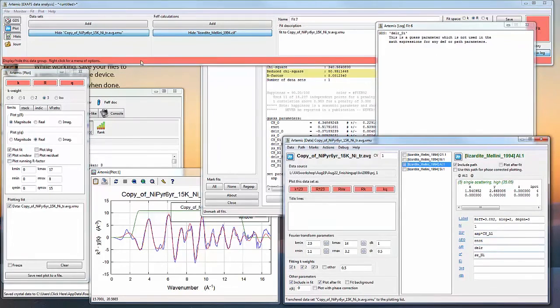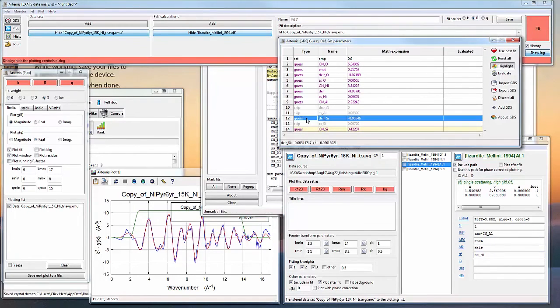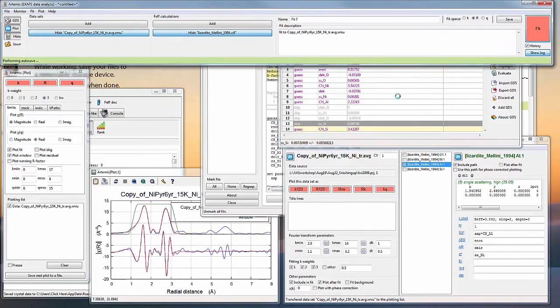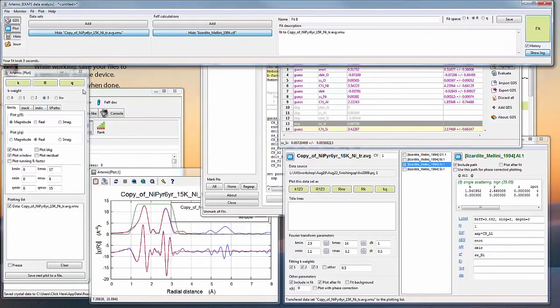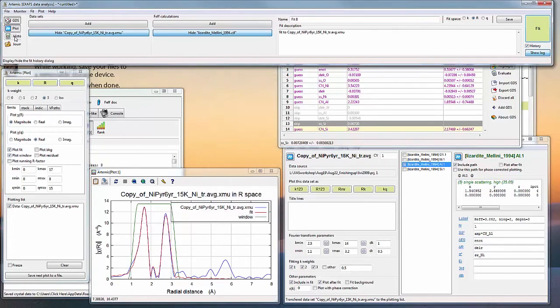Okay, I did not change. I'm basically trying to use this variable, but it didn't include it in the path list, so you get that error. Okay, you can see the color coding went more greenish.